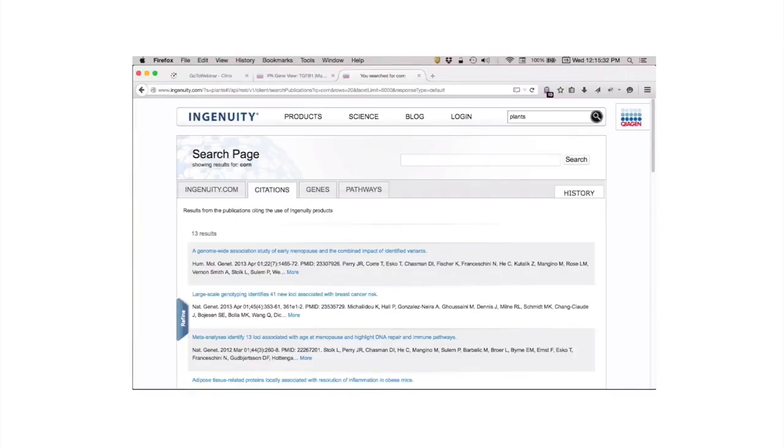Also, you don't want to put in 10,000 genes, because then you're talking about the whole genome or half the genome or a quarter. So we tend to like to put in a few hundred to a few thousand genes for the analysis. So we often change the fold change or the p-value cutoffs a little bit to make sure that happens. Like in this case, I usually use less of a fold change than 3, but there were so many genes that were significant that came through if you used a fold change of 2. So that was sort of the thinking.